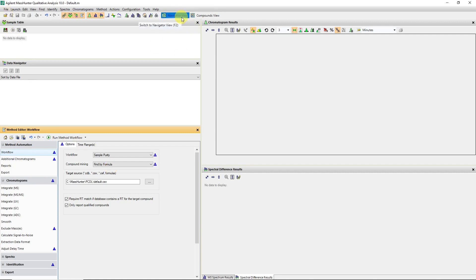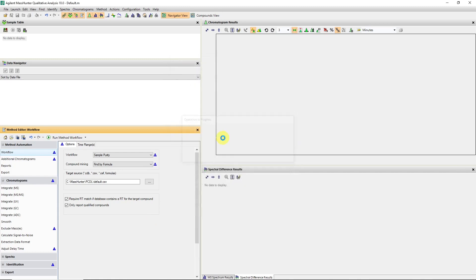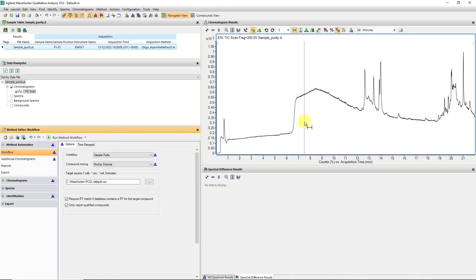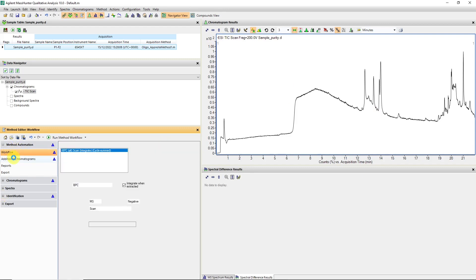I'm in Navigator view in my Qualitative Analysis 10 program, and I'm opening the data file without loading any results or running any methods. In this case, we can see a total ion chromatogram, and we can see it's been run in negative mode. So I'm going to extract some of my UV data.